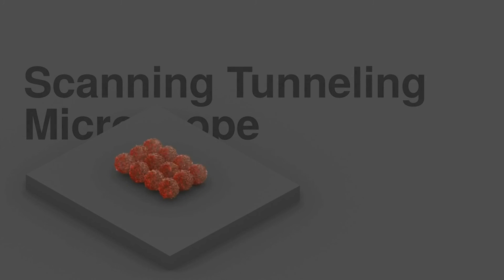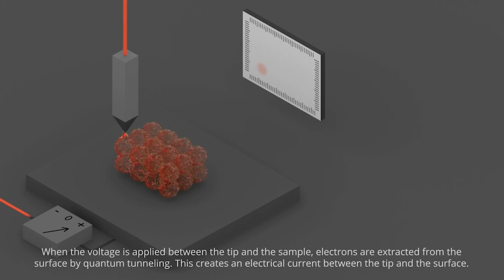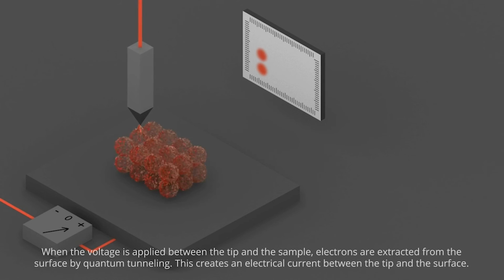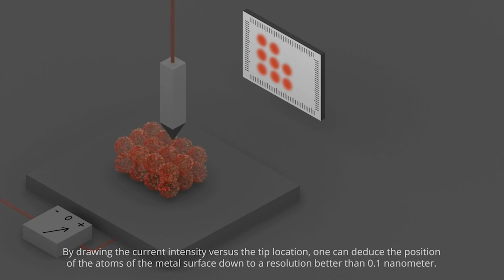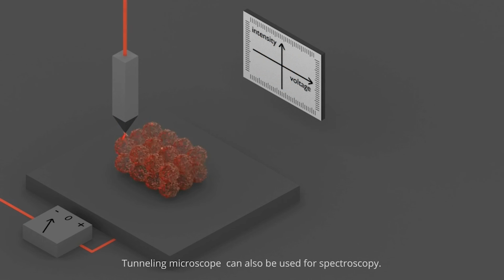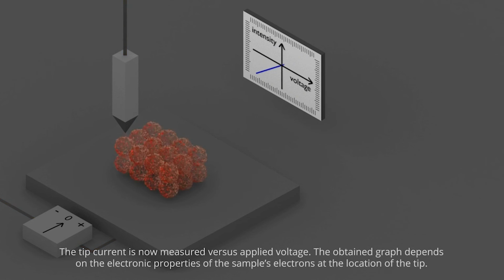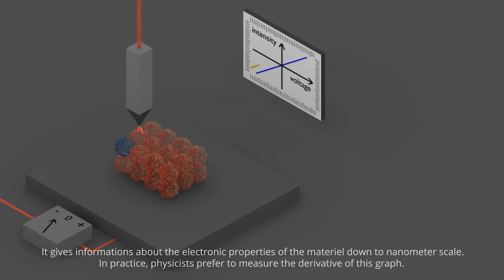So in a scanning tunneling microscopy, we are actually applying a voltage between our probe and our material. And as you can see, there would occur our tunneling effect, which means electrons would vanish from our probe and appear on our material. This is something like electrons flying, as I said. And via this way, we can actually plot the probe's position where we have this sort of current. And this means that there are atoms at those places where we have current actually. And after that, we will simply plot each point that we had this sort of current. And then it all depends on our material surface. So after doing all these things, there will be a plot, an image of our material surface.